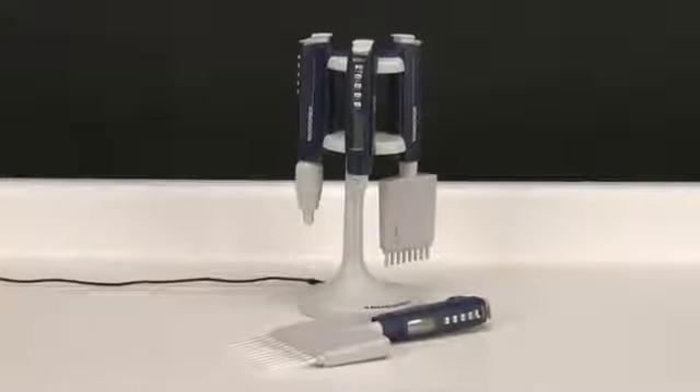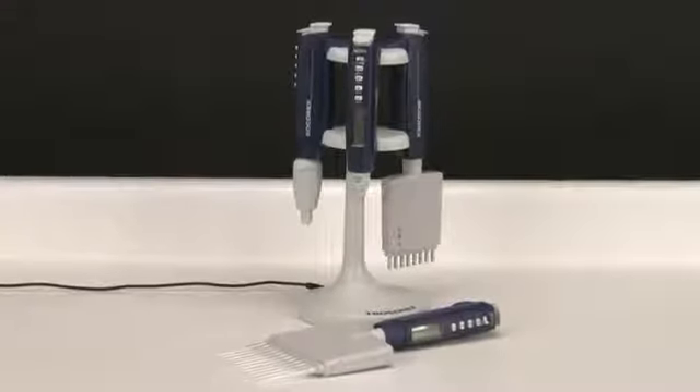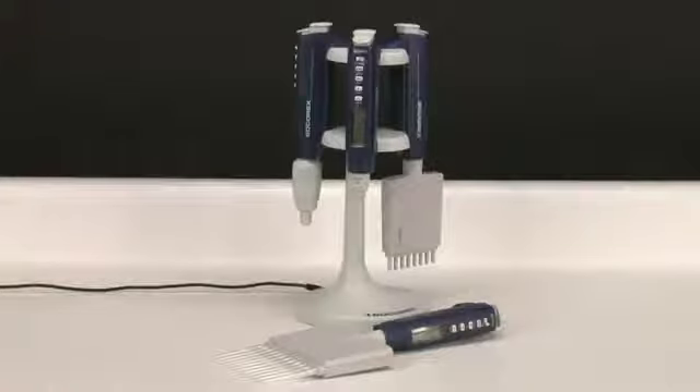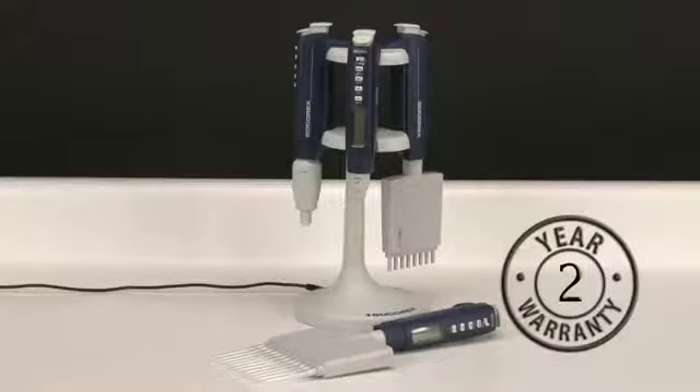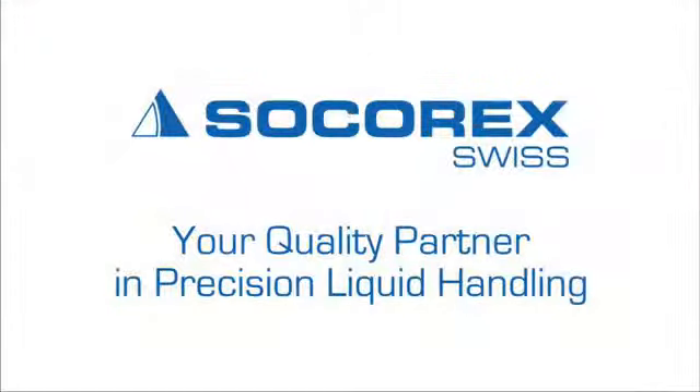Socorrex pipettes are engineered and crafted from the highest quality materials to ensure reliable, long-term, high-precision operation. They come with an individual QC certificate and an industry-exclusive two-year warranty. Socorrex is your quality partner in precision liquid handling.